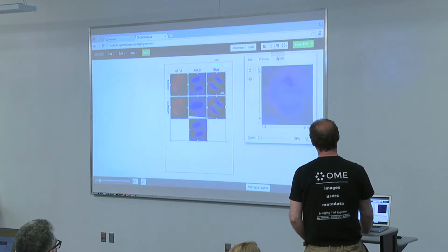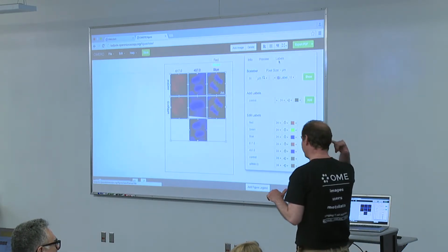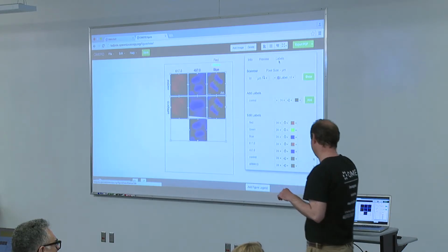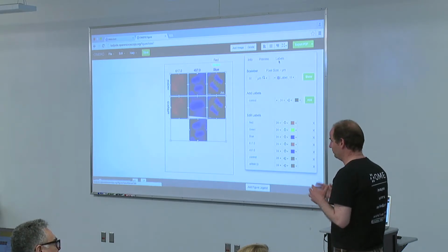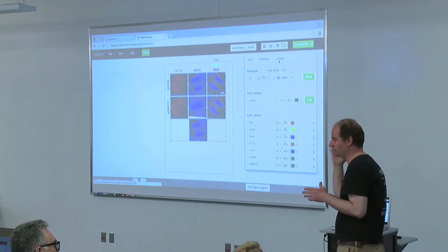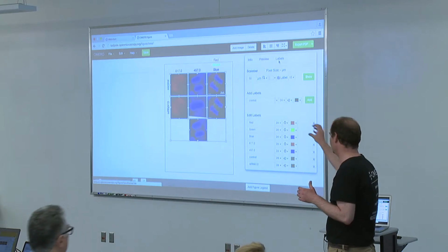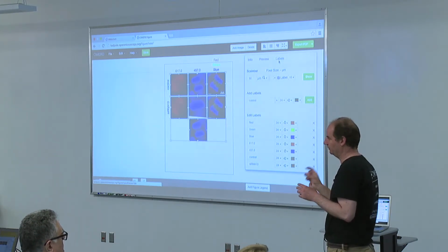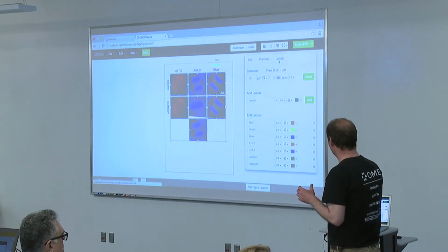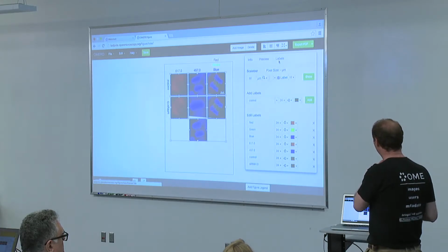Now, if I have such a figure, I can also crop the regions. I forgot the next step of Will Moore, who is the developer of this application, is to be able to draw regions of interest even on the figure. That's what people want the most, to put the text labels, to make an arrow to a cell in the image. I showed you already, you can make a zoom of it, but you still want to point the pointer to it, and you want to have it in your original figure. So that's his next step. He's got already a PR open for that.